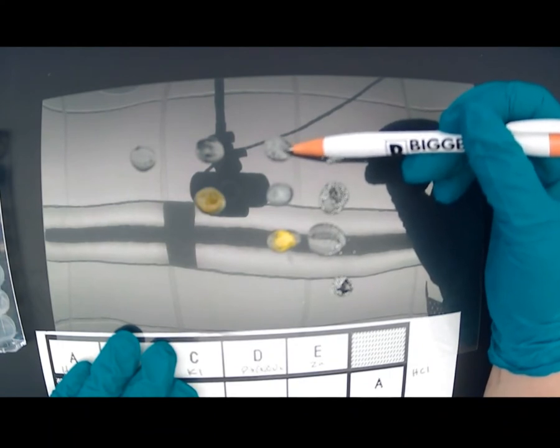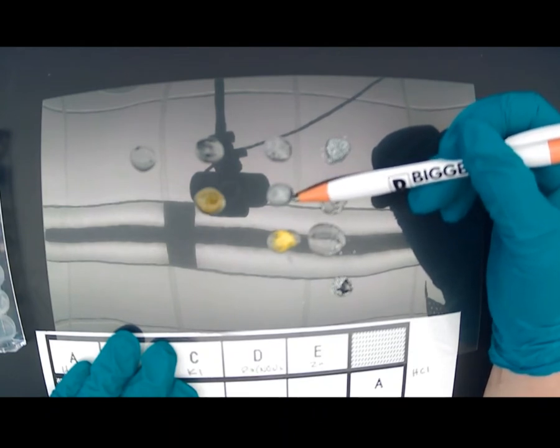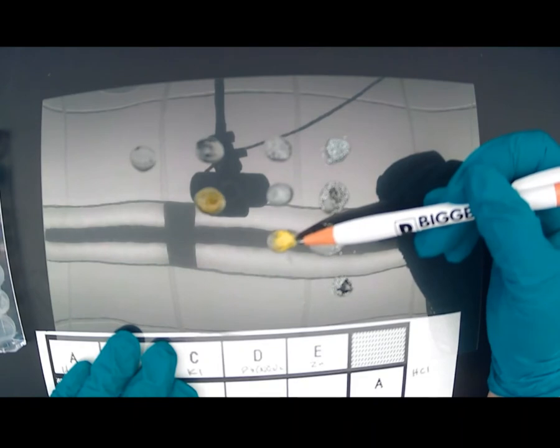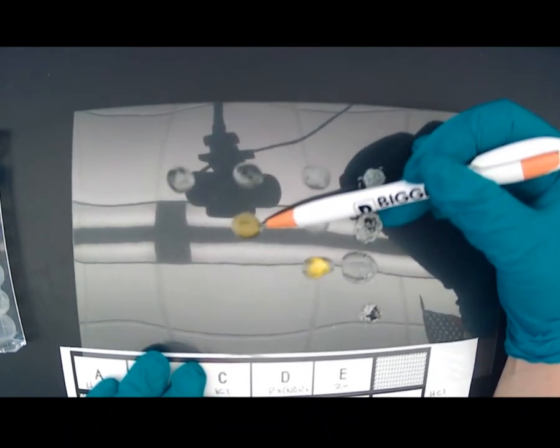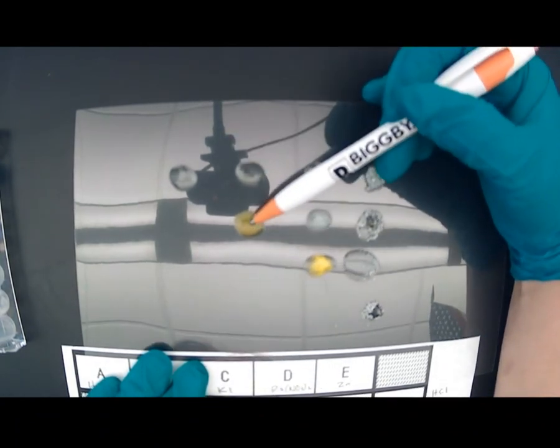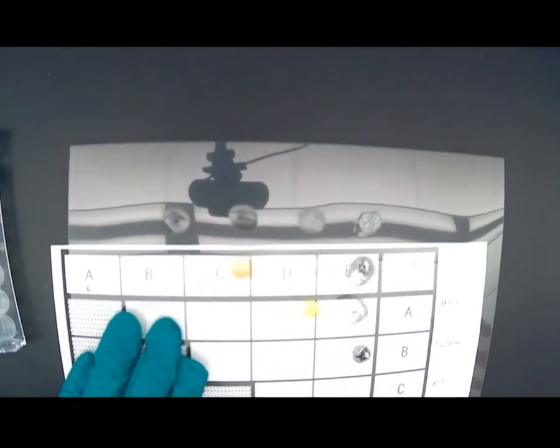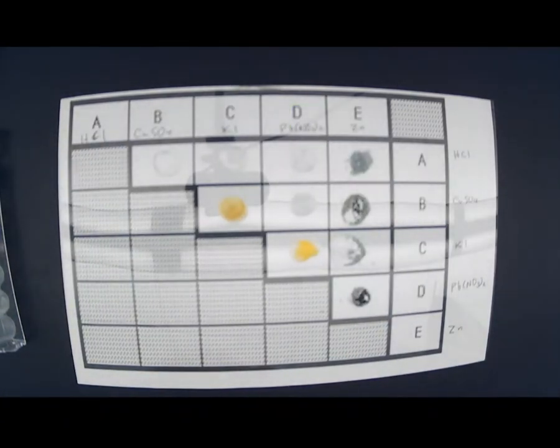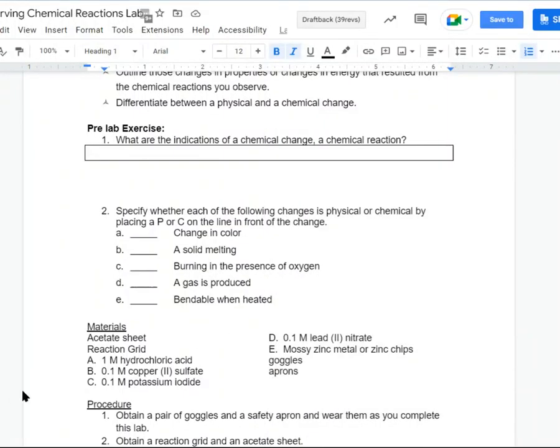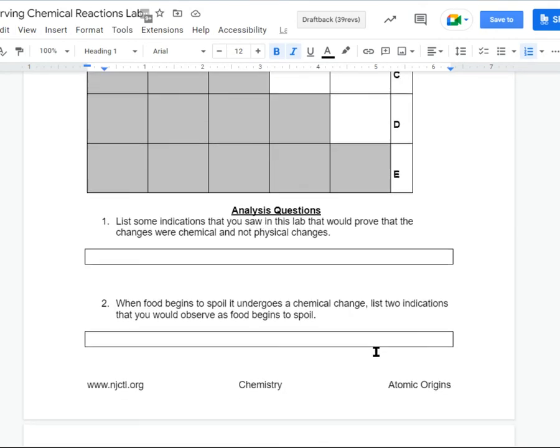White precipitate by large crystals big enough to see. I also see white precipitates here, although they're much smaller, so it makes it look kind of cloudy. Yellow precipitate here. This one nothing. And this one is a brownish — it looks like it's actually a precipitate, not a solution, because it's opaque. Not much happening in this one. You're going to write your observations in these boxes in the corresponding spots and then answer the questions.